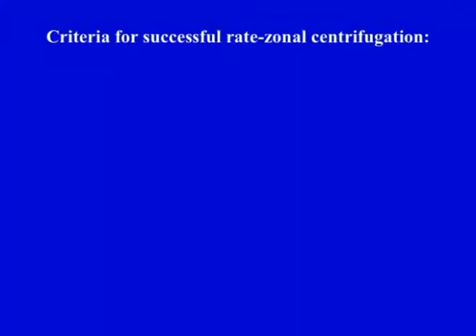Now, what is the criterion for successful separation here? What we have said is that the density of the sample solution must be less than that of the lowest density portion of the gradient.